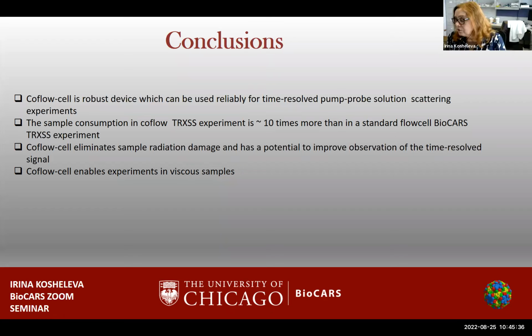Okay. So for the pH jump, we were actually talking about pH jump measurements at our beamline. The published pH jump measurement so far was done by Lin Chen's group. And the pH jump basically was initiated by the laser.